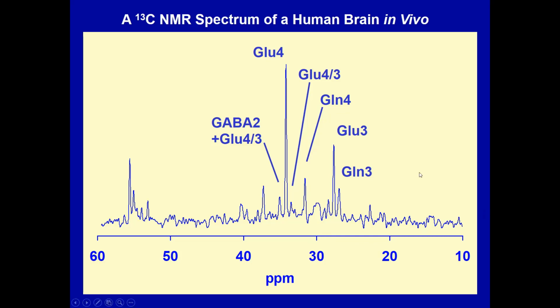Now, I say probably because once in a while you encounter two chemicals that resonate in the same place. But for the most part, for most of what we look at, that's not the case. There are a few cases that we take into account regularly.